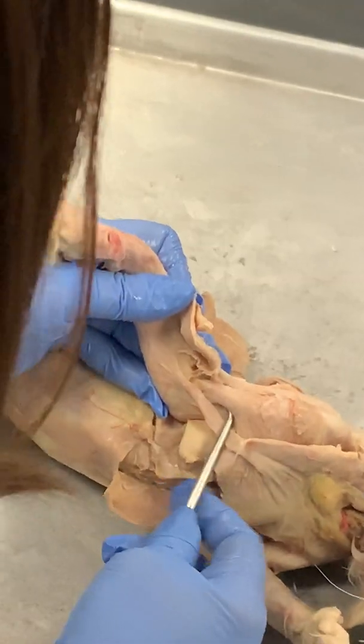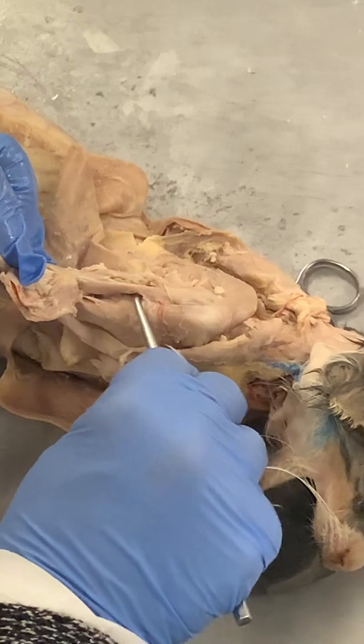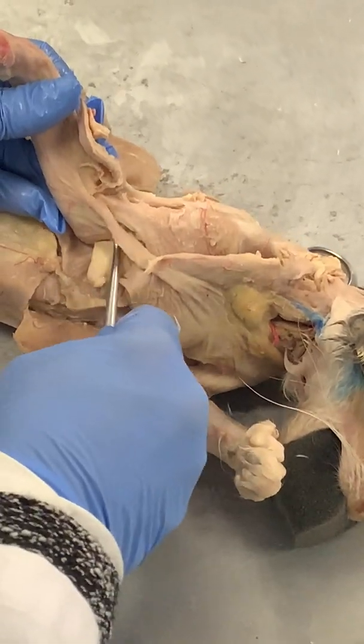This is biceps. This is a muscle you don't have to know here — more of a stabilizer. This is your little biceps.